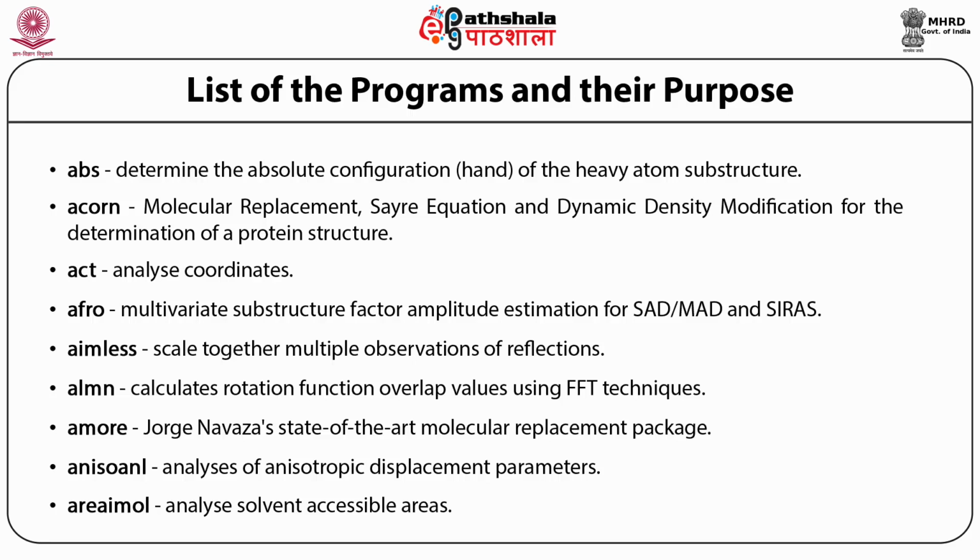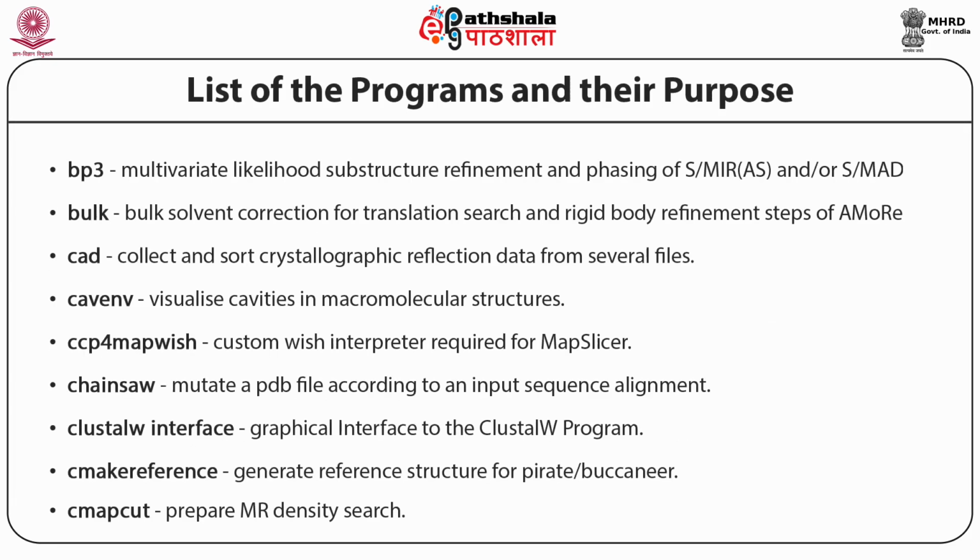Then we have anisotropic displacement parameter analysis for the program ANISOANL and so on. Then for solvent correction we have a program called BULK. Suppose you have the crystallographic reflection data from several files, how to collect and sort.